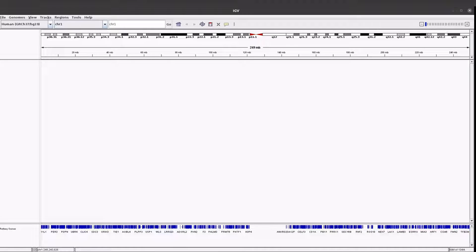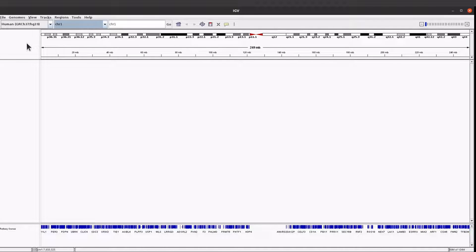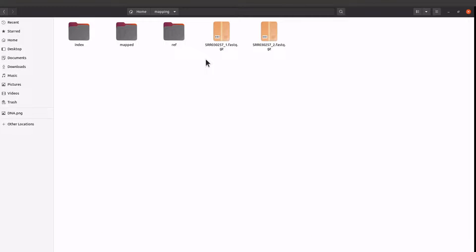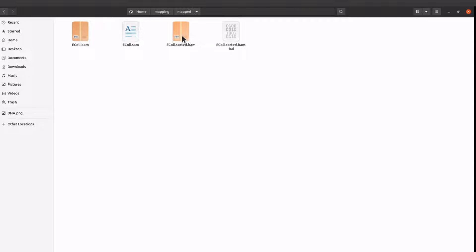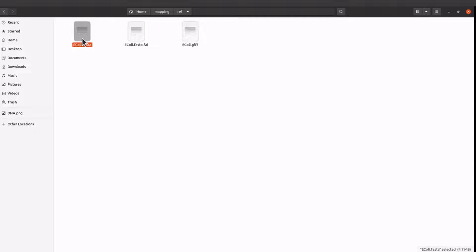IGV has been opened. We are going to load the BAM file here, and we're also going to load the reference sequence. If you have your IGV opened you may see this, or you may see another reference sequence being loaded. We are going to load our own reference sequence and then the BAM file. So these are my files - in the mapped folder I have my BAM file and also my reference sequence. I'll go back to IGV and load them.